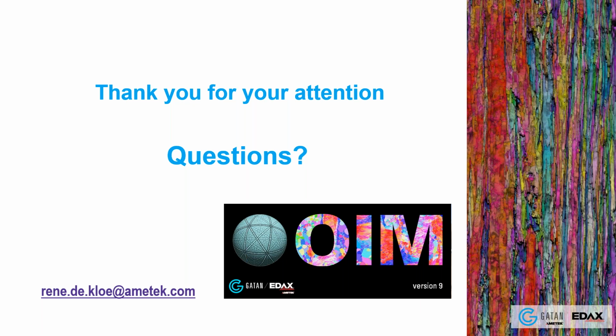That's a good one. How much time is typically allocated for the microstructure analysis? I guess that really depends on your field of science or where you are located. In a university or a research institute, it can be that your data acquisition takes half an hour and you're spending 2 weeks for the reprocessing, if you really want to understand a lot of details.